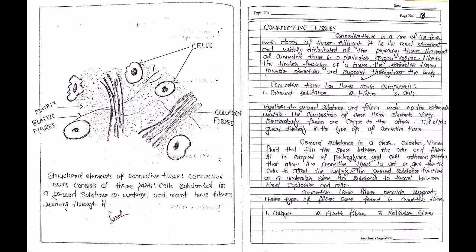And then we see the connective tissue. Connective tissue is one of the four main classes of tissue. Although it is the most abundant and widely distributed of the primary tissues, the amount of connective tissue in a particular organ varies.